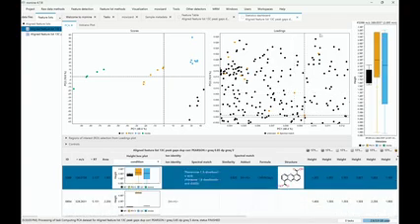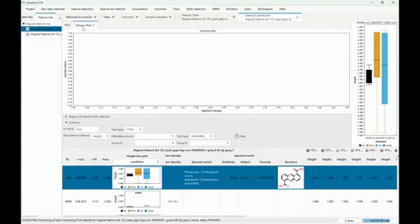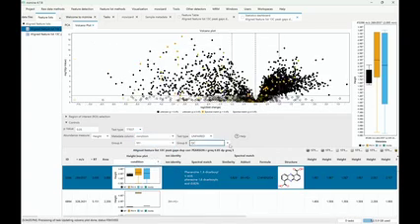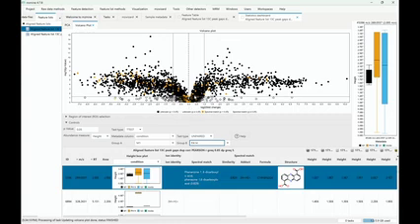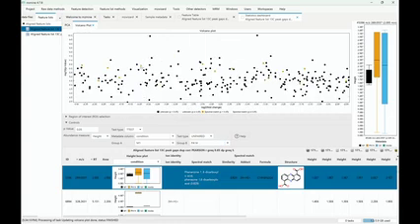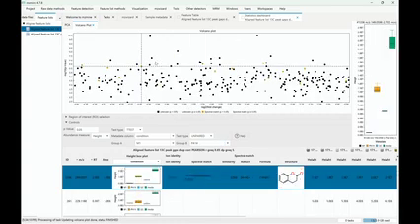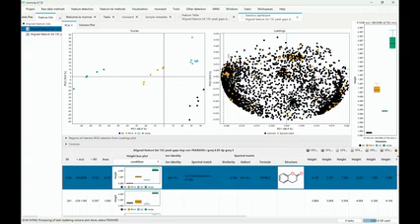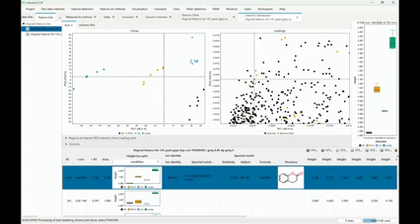We see directly the box plots. And if we also want to compare two groups, because actually we only have two different strains, we can switch over to the volcano plot. And with a volcano plot, of course, we select the condition column. We can select M1 and PA14, the two strains. And the great thing here is that now if I select any of those features, again, it's going to be selected in the table. And also I can go over to the PCA plot, and they're both linked.